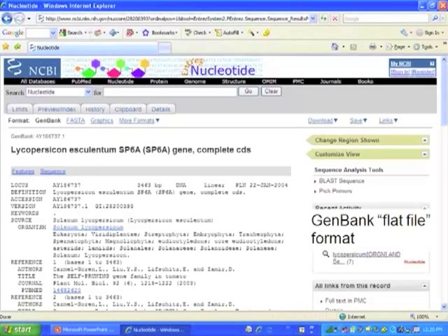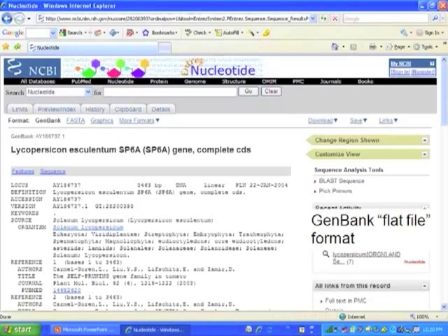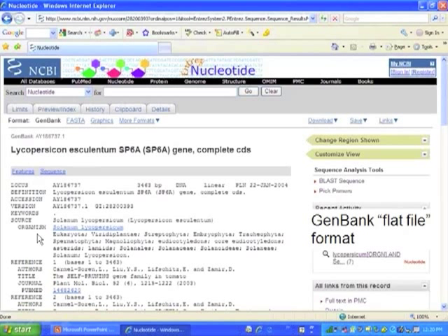The kind of information that is stored in GeneBank is demonstrated by this screenshot, which shows the top part of a GeneBank flat file for the SP6 gene — the gene that determines whether a tomato is a bush or a vine. In the nucleotide database there is quite extensive information related to the function of that gene. This would be what Alan refers to as annotation — this is detailed annotation information.